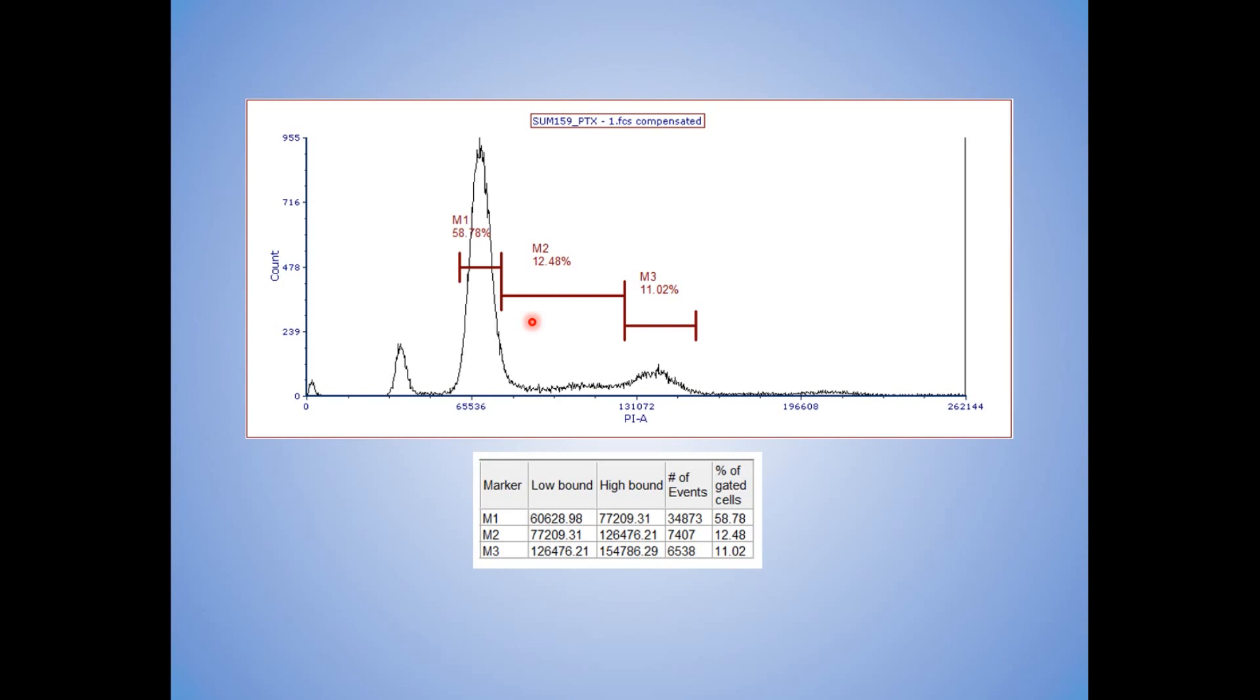You get five alerted cytometers, you might end up with five different, slightly different results. But here's the bigger problem. This is one. Okay, just for ballpark for one. That's okay, but I have 12 files.